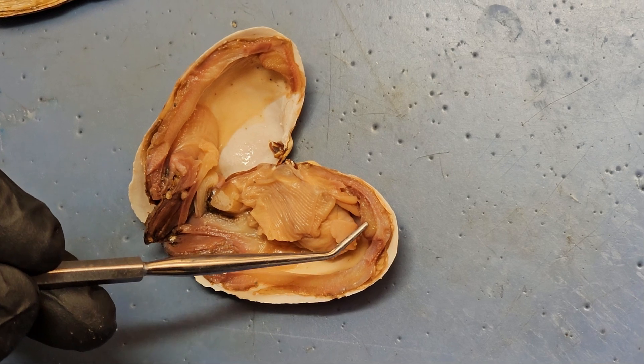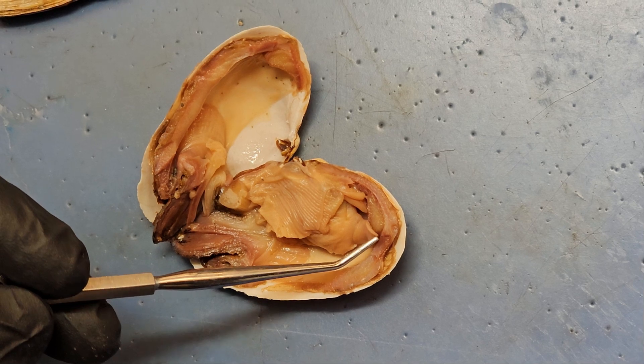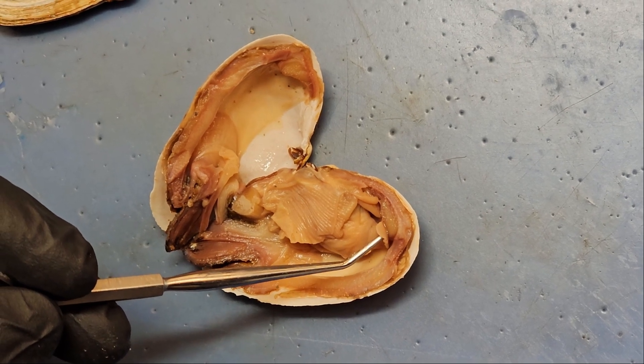We've already identified the anterior and posterior adductor muscles. This little thing right here is the foot. Different species of clams have different sizes of foot — this one has a little tiny foot.